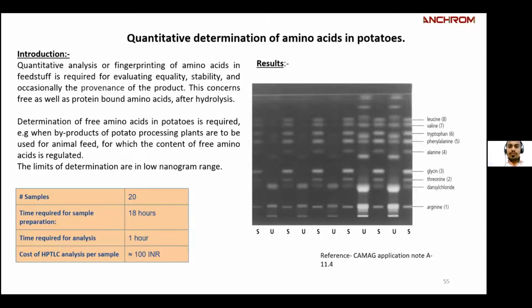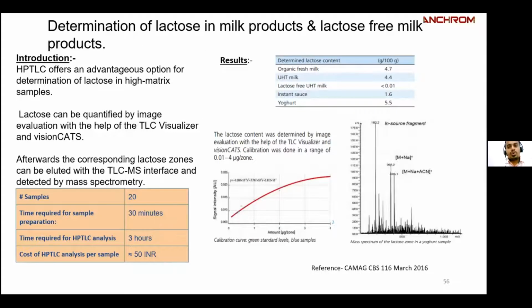Determination of lactose in milk products and lactose-free milk products also. So this can be used to detect, if a product is claiming it is lactose free, you can check by using this method whether lactose is present, and if present, how much is present.